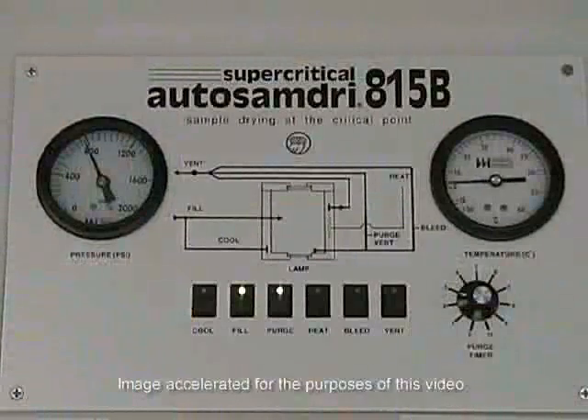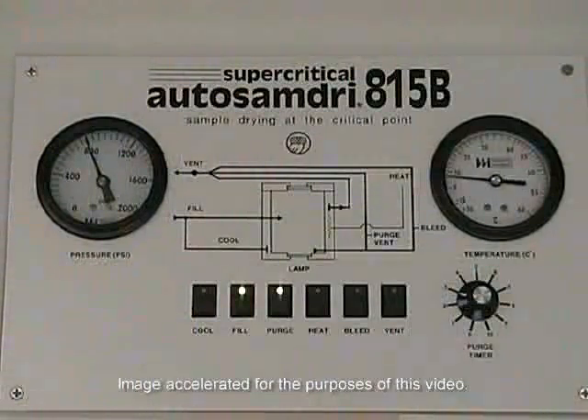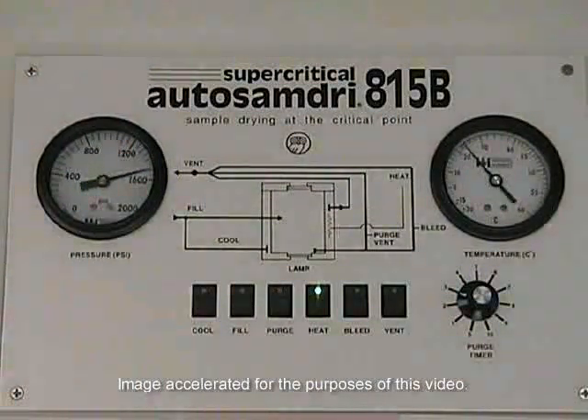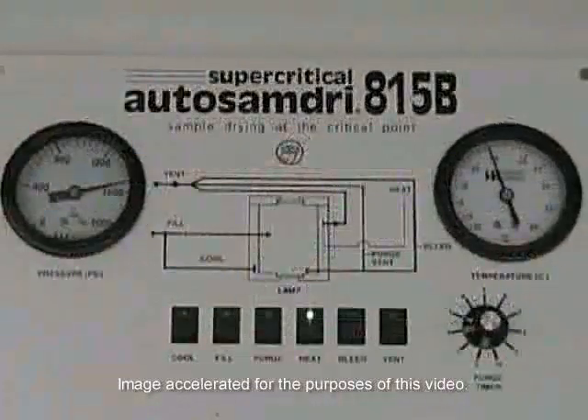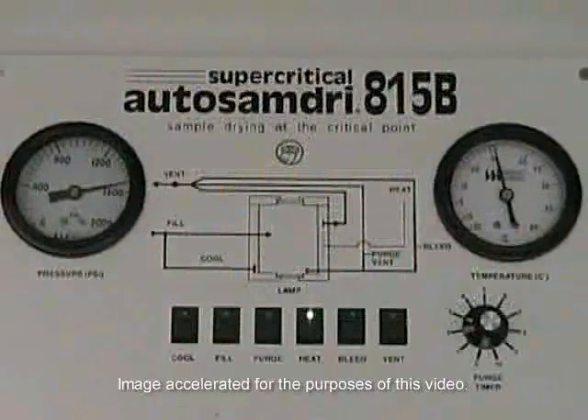Upon completion of the purge mode, the unit will automatically advance into a post-purge fill mode in which the chamber fills with liquid carbon dioxide for an additional four minutes, indicated by both the fill and purge LED illumination. Upon completion, the purge and fill LEDs will turn off and the heat LED will illuminate. The heat mode is the stage in which the samples are carried through the critical point, with both pressure and temperature steadily rising. When the chamber pressure goes beyond 1072 PSI, it will stabilize in the neighborhood of 1350 PSI.